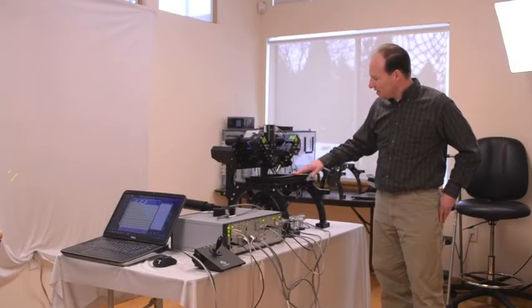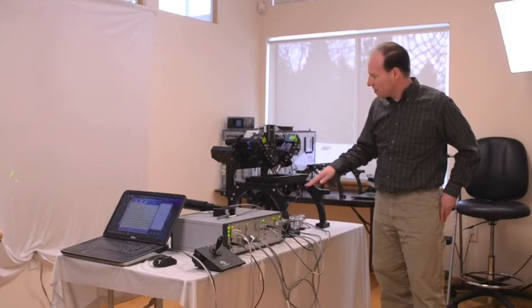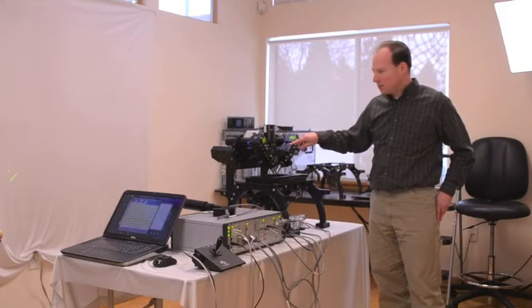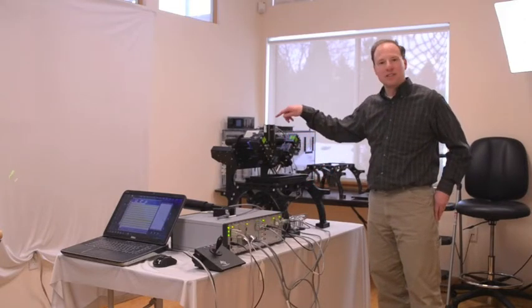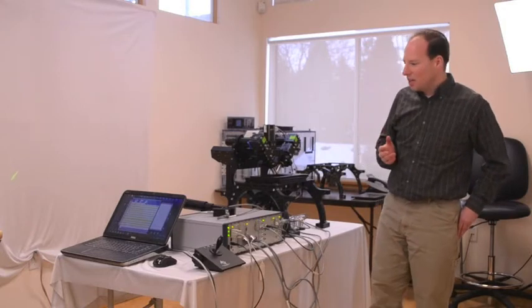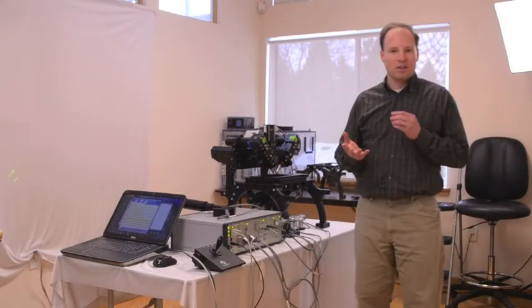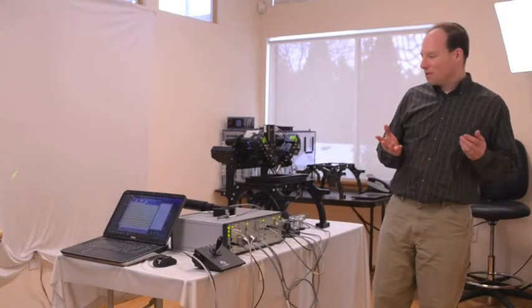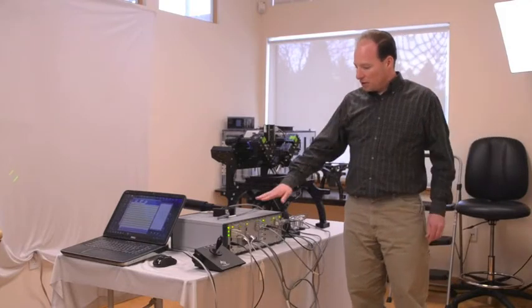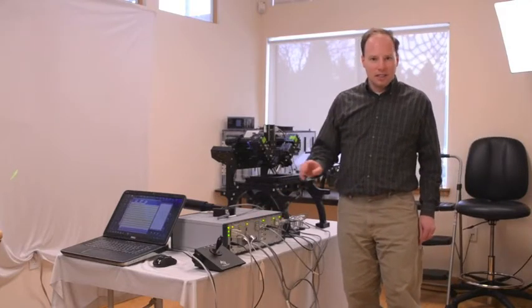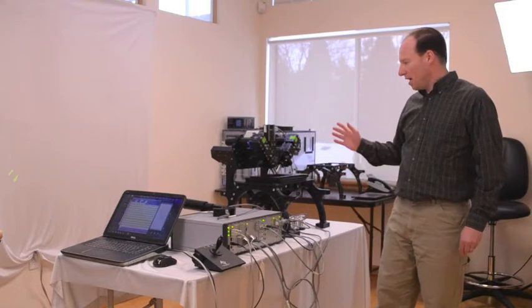The XY stage, the linear stages on the top and the bottom, the two piezo objective movers, and the two scanners that each have two axes. So our conventional WizKit controller simply wasn't enough. So this is a modular controller, meaning that it's easy to just add a new card. If you add something else, say you wanted to add a filter wheel, then we can just add a new card.